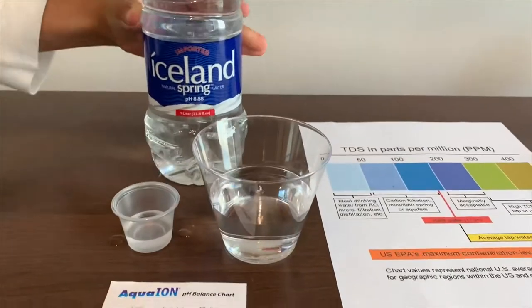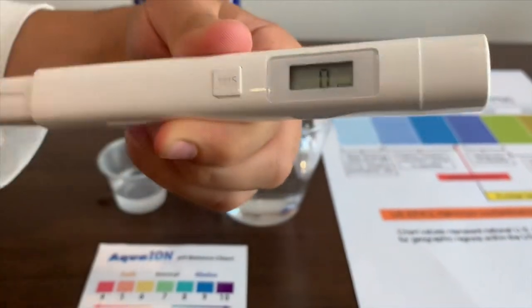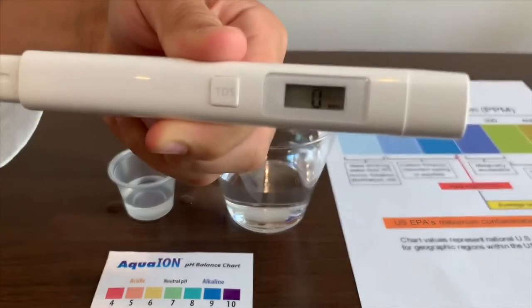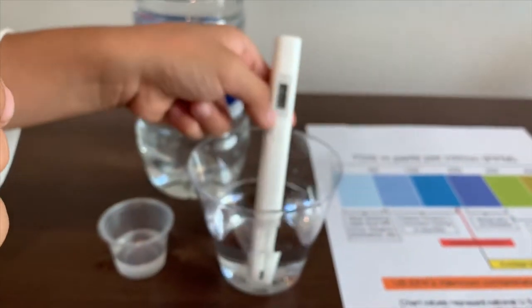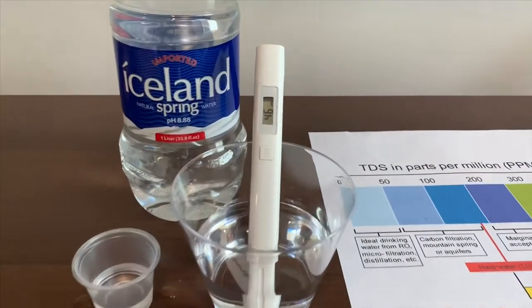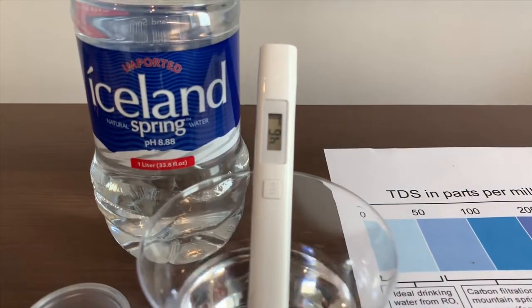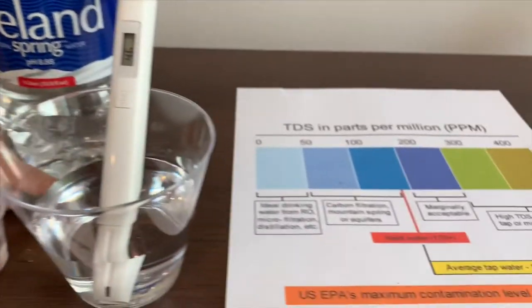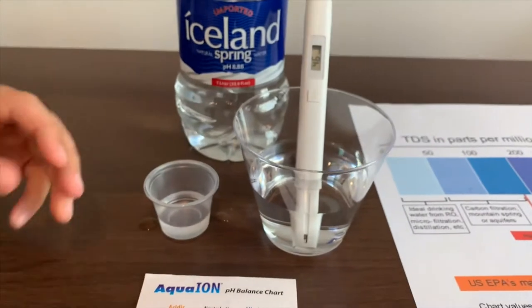First we're going to test the TDS level. Turn on the TDS tester, make sure it says 0 and put it in. It is 46. That is ideal drinking water. Now let's test the pH.